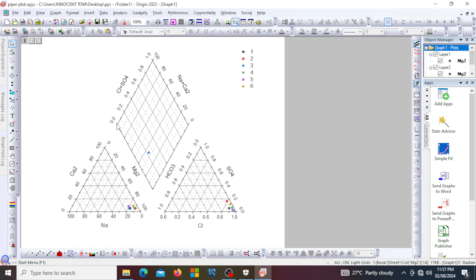For water type: if your data point falls towards the middle, you typically say your water is fresh. If your data point falls towards the sodium and chloride vertices, you say your water is seawater. If the data point falls between the fresh water and seawater field, then you say it is brackish.